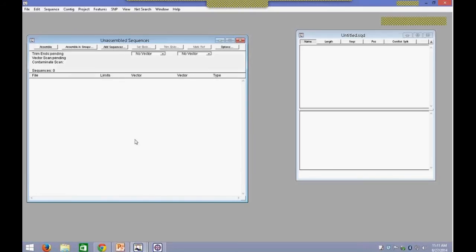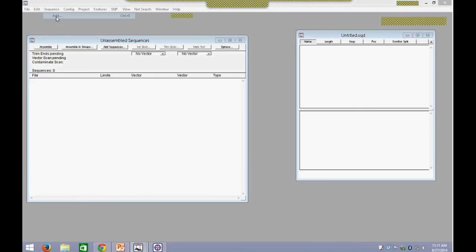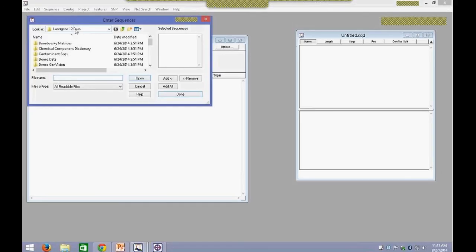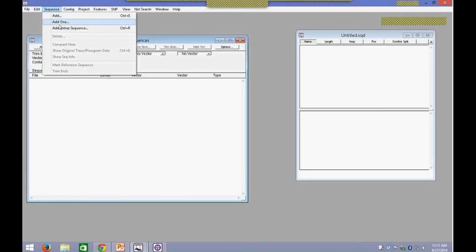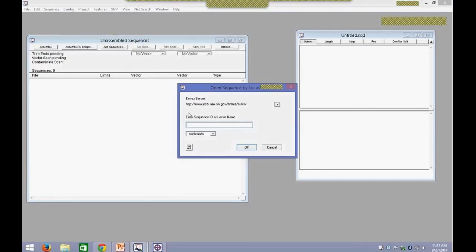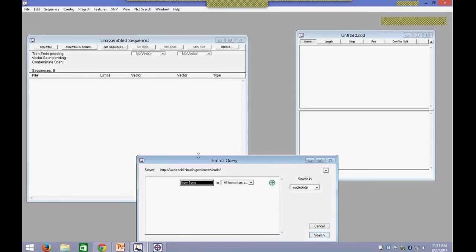There are multiple ways of importing data. You can go into File > New to start a new project, File > Open to open an existing project, or File > Import. You can also go into the Sequence menu and choose Add, which will open a dialog where you can browse to your sequence location and import your reads. You can also go into the Sequence menu and add an Entrez Sequence if you have a Locus ID or Sequence ID, and you can search through the various NCBI databases such as Nucleotide, EST, and GSS.